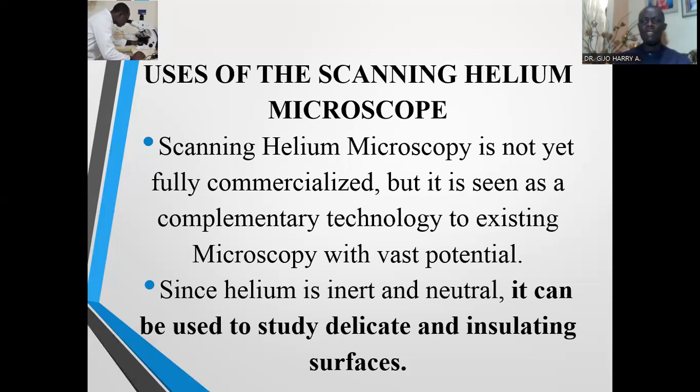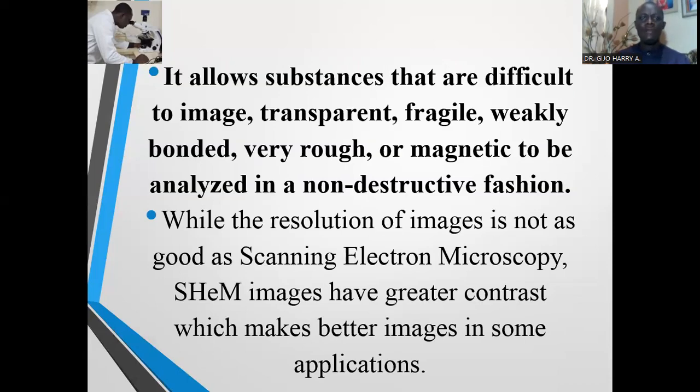It allows substances that are difficult to image, transparent, fragile, weakly bound, very rough or magnetic to be analyzed in a non-destructive fashion.